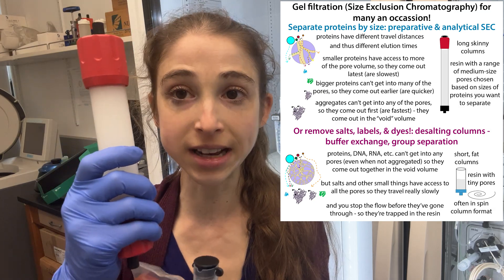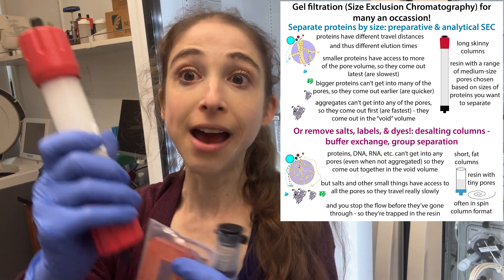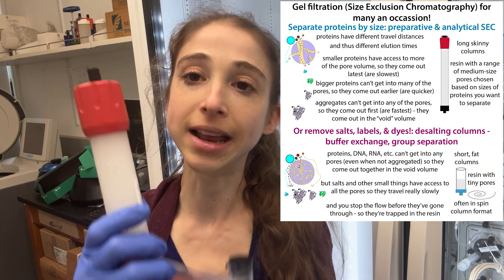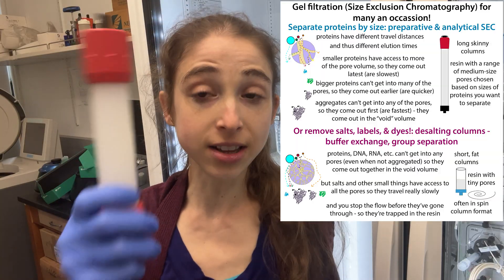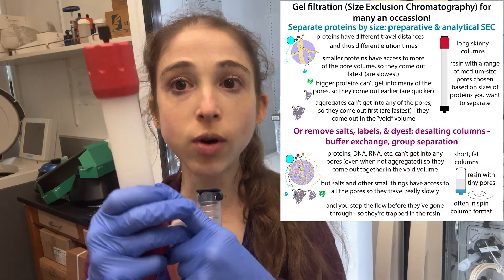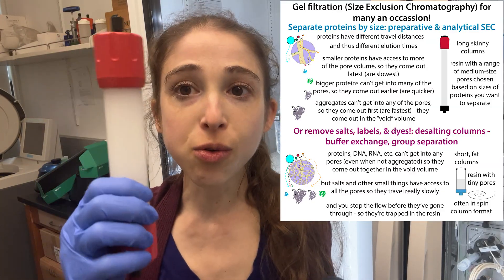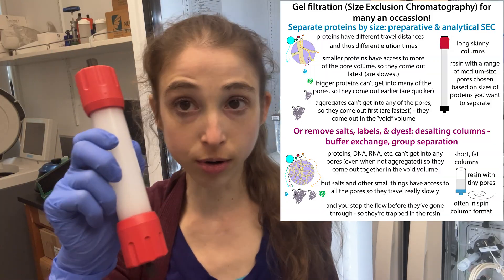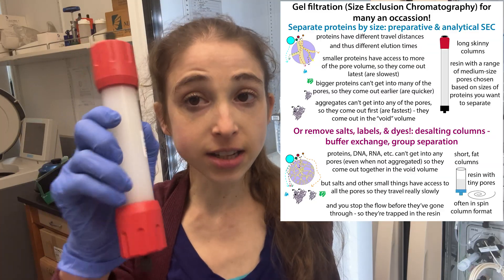The big stuff that comes in is going to come out with the little stuff that had come in before it, and the little stuff that comes in is going to come out after — long enough that you're able to actually trap it in the column and remove it from whatever was in the column already.